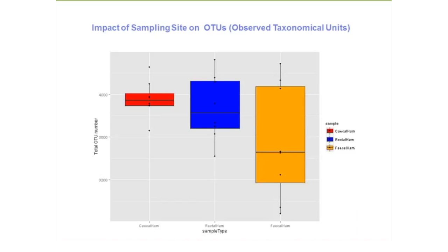We collected cecal samples, rectal sample, and fecal samples, and we treated them all in the same way. We processed them under the same condition.